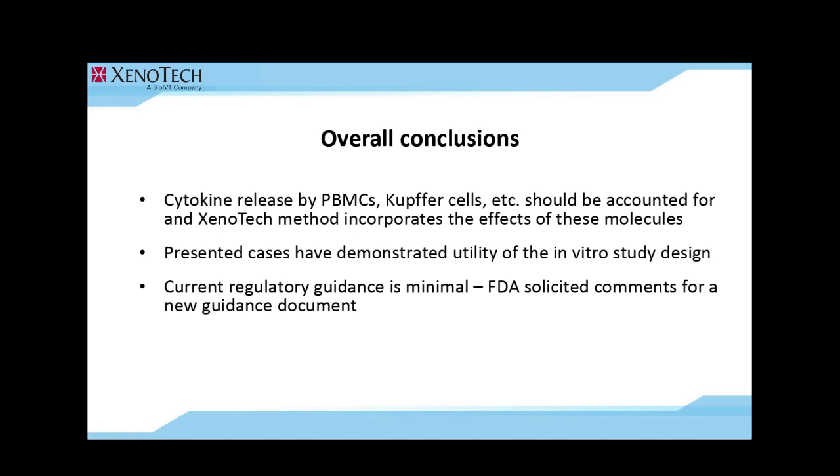I'd like to also indicate that current regulatory guidance is minimal at the moment. As we know, FDA just solicited comments for a new guidance document, and therefore I think that as more studies conducted according to this study design are made public, it will be easier to formulate recommendations for the use of the assay as a predictive in vitro tool. More specifically, which immunomodulators can be meaningfully evaluated in the assay, and what cytokines, at what level of their stimulation in vitro, warrant moving past the cytokine release assay into the stage of treating hepatocyte co-cultures with the plasma.